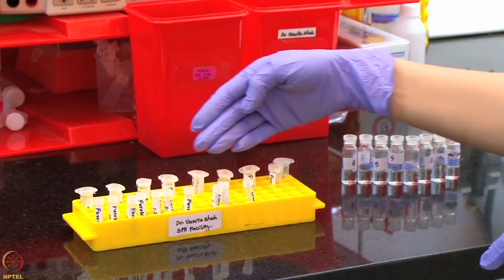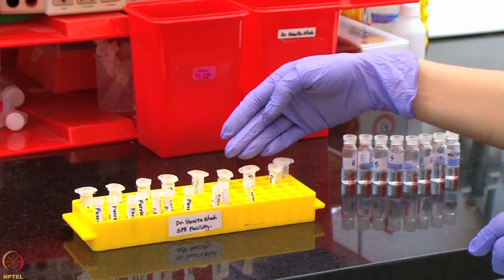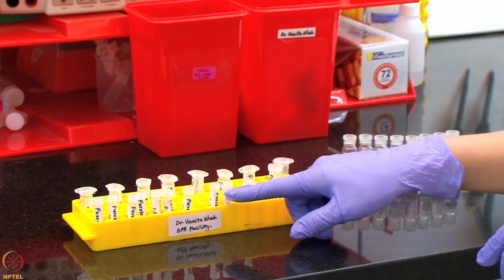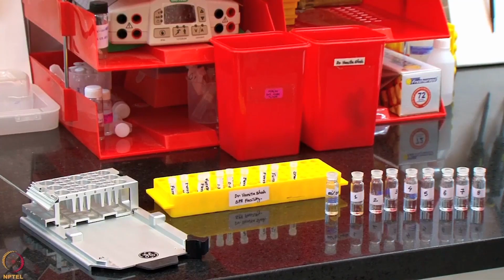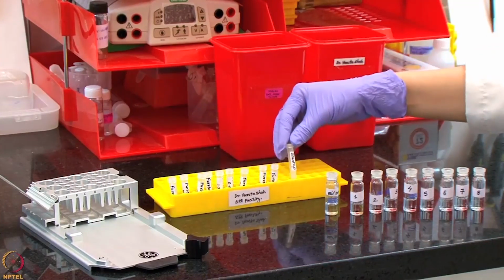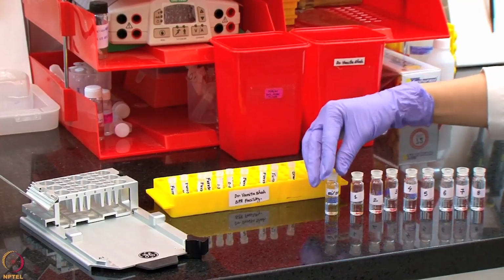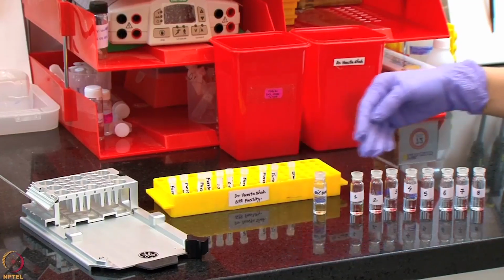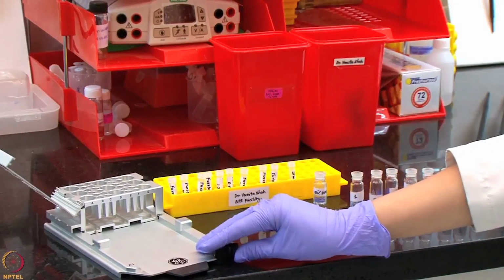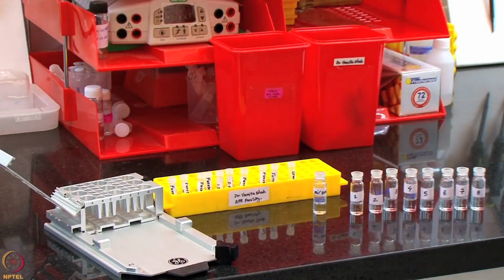All of these samples and reagents have now been aliquoted in the required volumes in these specialized tubes. We will now proceed to insert these tubes, including the samples, the starter, 50% DMSO and the solvent correction solutions into the appropriate rack and then into the system.